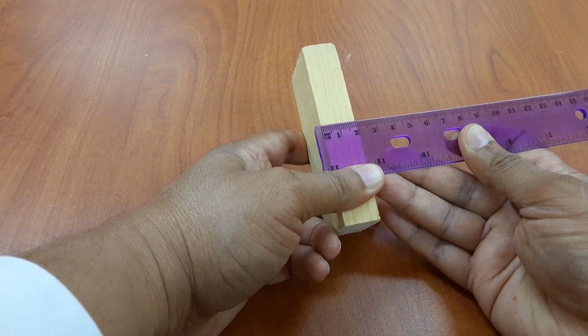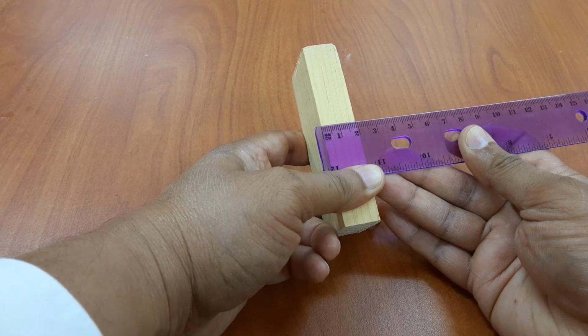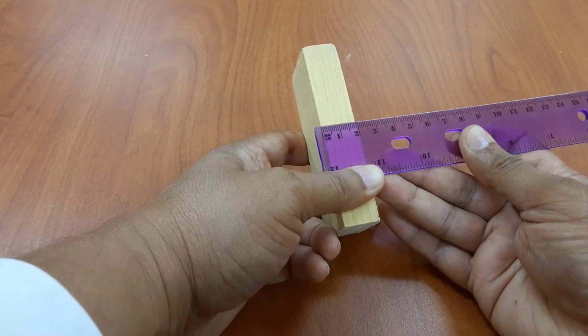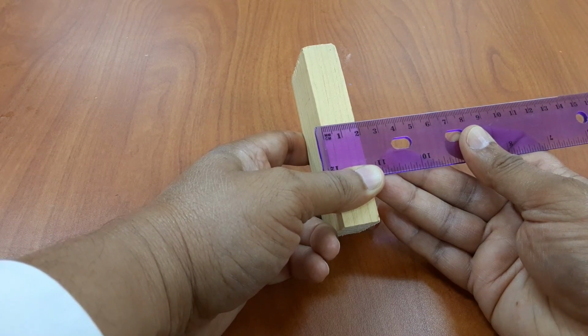So please make sure that you write these length, height and width down, and then you can multiply these three together to get the volume. And do not forget to write a unit for volume, the appropriate unit.